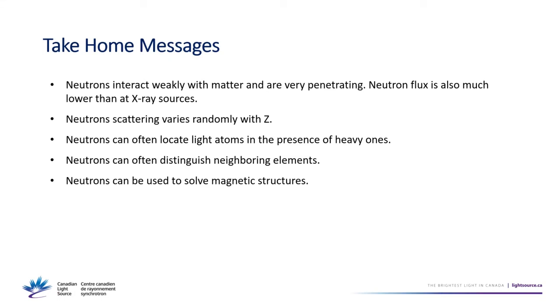You can actually use a hot moderator, where you're getting a higher energy of neutrons out, and do PDF that way. So you're not going to have quite as high resolution in reciprocal space, so your PDF will tend to die off a little quicker than it would with a spallation source. But there is a beamline at the ILL that uses a hot neutron source to do PDF.